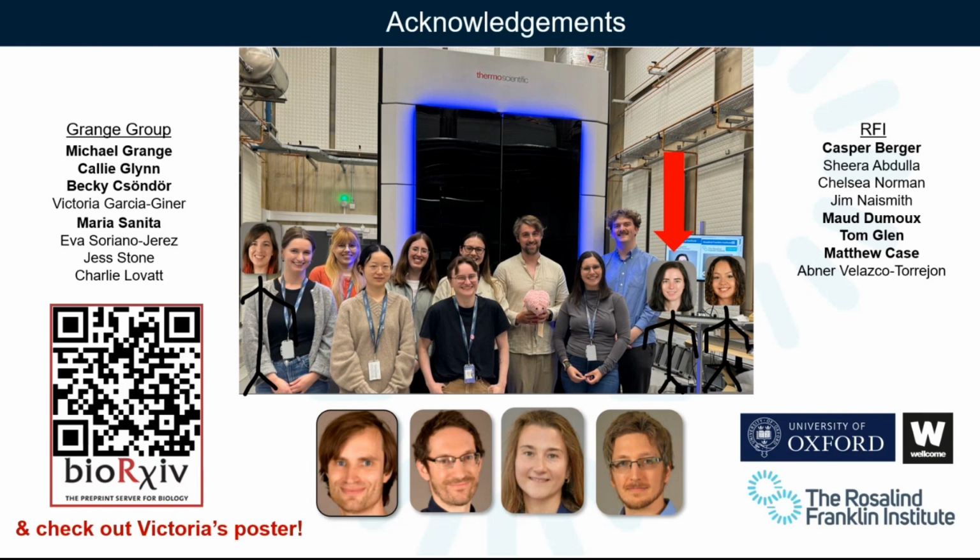But in theory, you could slice. One slice takes about 30 seconds and then run downstairs and freeze it within minutes. But we tend to do serial sectioning, which takes a little bit longer, and then freeze them all at once. But there's no reason why you couldn't take the brain and immediately freeze it within minutes.